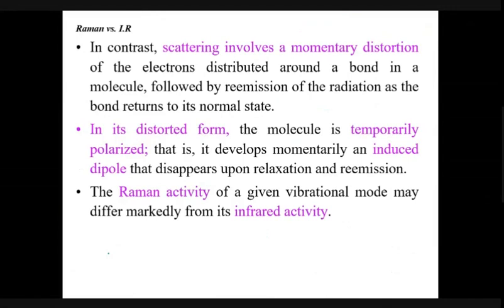It is only momentary polarization. In its distorted form, the molecule is temporarily polarized. That is, it develops momentarily an induced dipole that disappears on relaxation and re-emission. The Raman activity of a given vibrational mode can differ markedly from its infrared activity.